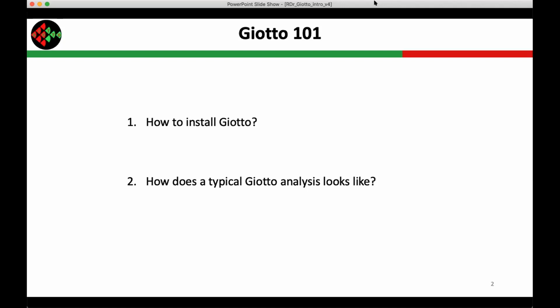The reason they're so different is because there are a lot of different technologies that came out in the last couple of years. This is a very recent review of the Lundberg lab, where you can see all these different spatial technologies that developed, and each of them is very different. Now there's even a new technology called PPC. But Giotto can actually be applied on many of these different data sets, as we have already shown.